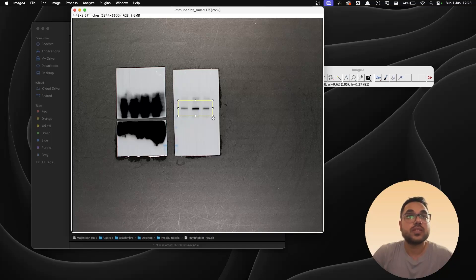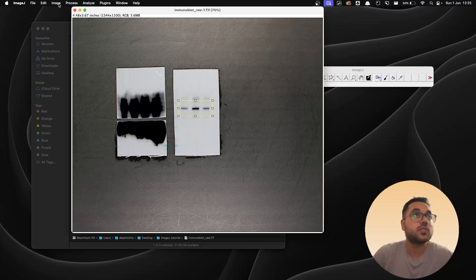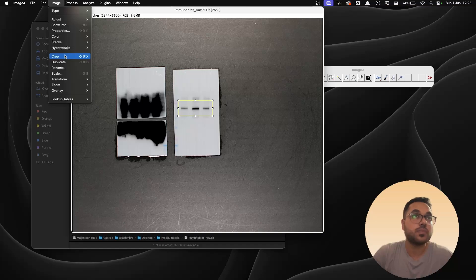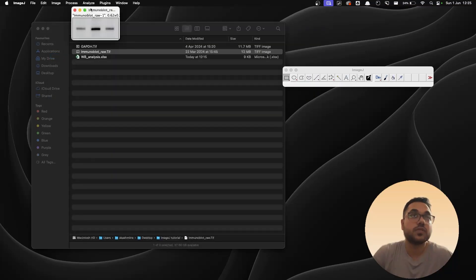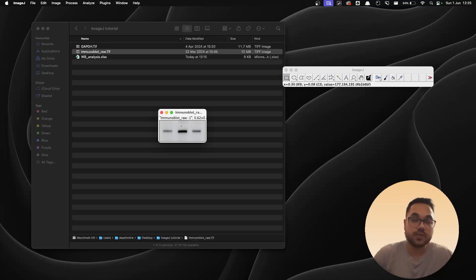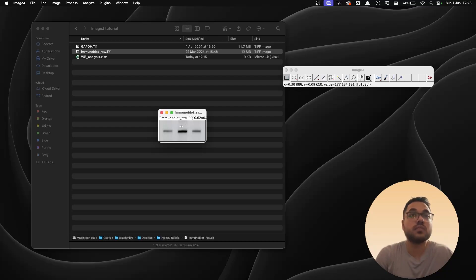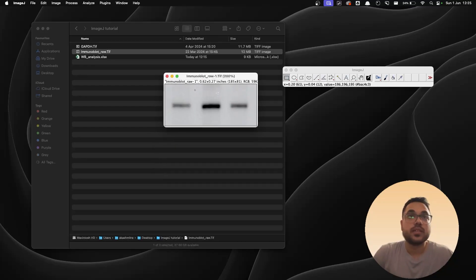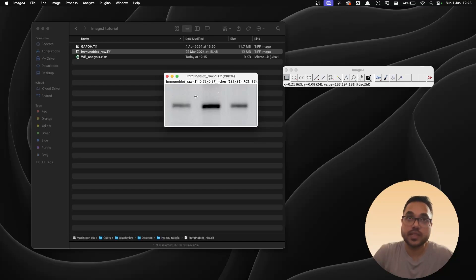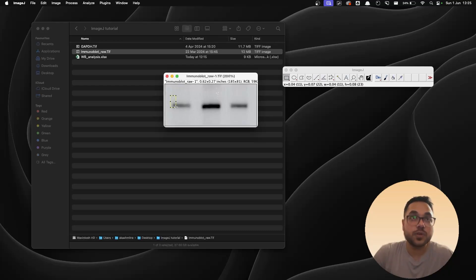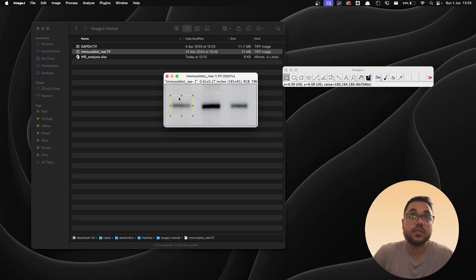And once that is done, I'm going to go to Image over here and I'm going to hit crop. The shortcut for this is Command+Shift+X. And once we have the isolated blot, I'm going to increase the size a little by hitting Command+Plus on my keyboard. Now we have to analyze the individual lanes that are there. So in order to do that, just take your rectangle tool which is already selected in my case and draw a rectangle around the blot, around the first lane.